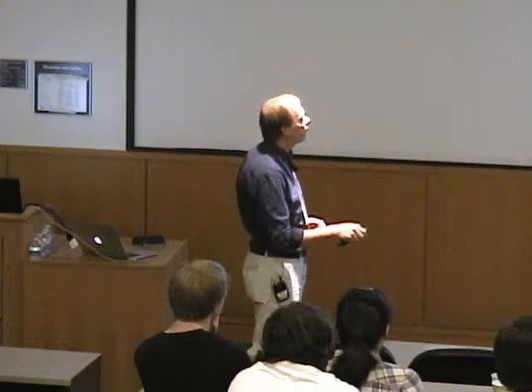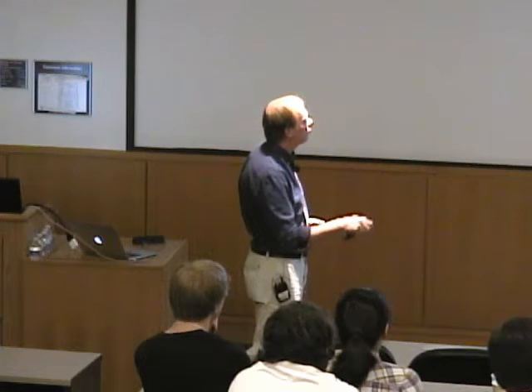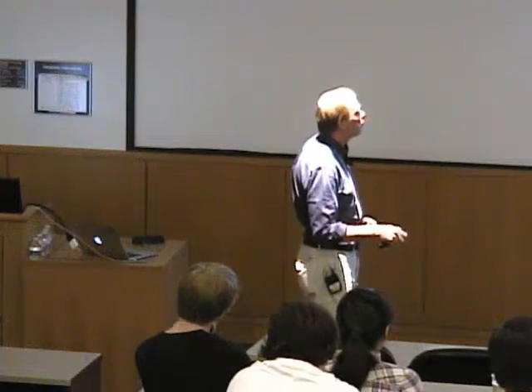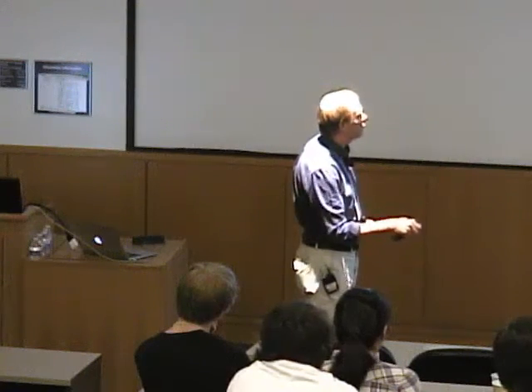And if you make this number big enough, then the distance in Gauss, or millitesla, between here and here, is determined entirely by the modulation amplitude, right? And so when measuring a spectrum, it's important that we work in this range and not somewhere here. That, of course, is a problem if I have two species in my sample, one of which has a broad line and one which has a narrow line, right? And so sometimes it's not possible to find a modulation amplitude which is appropriate for all of the components of your signal. Usually it can be done, but not always, right?